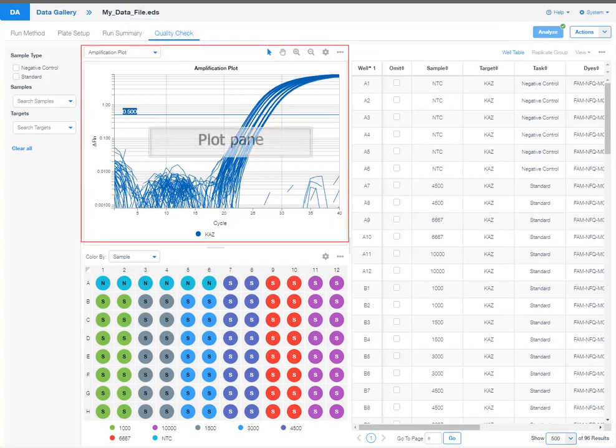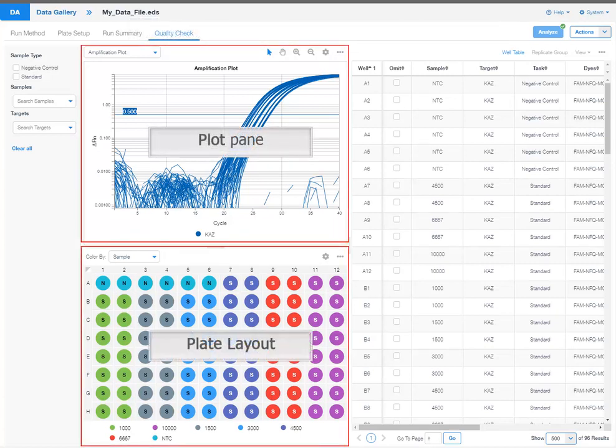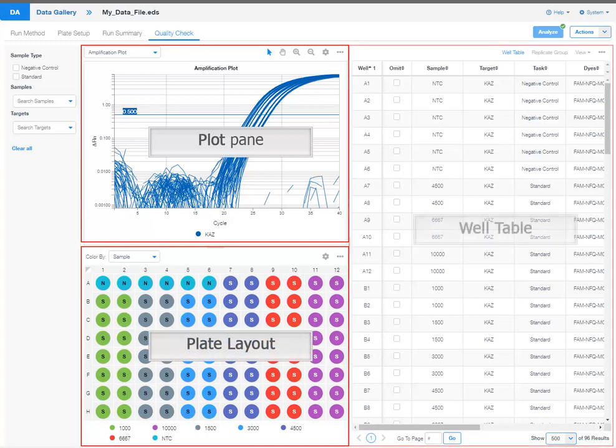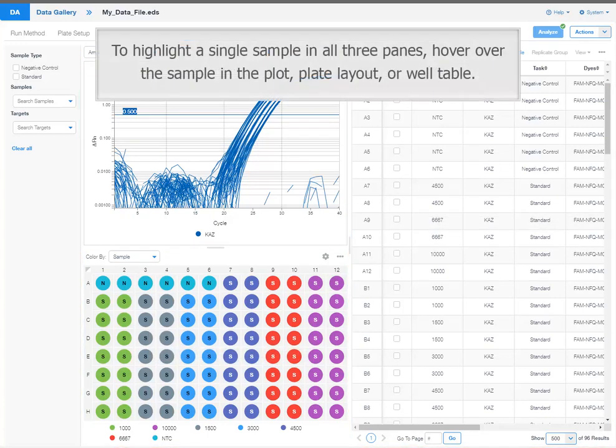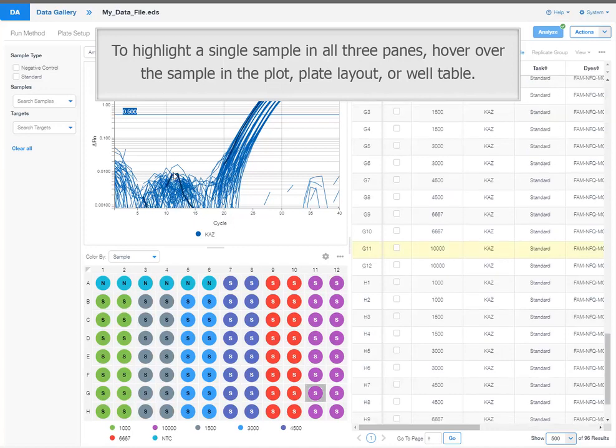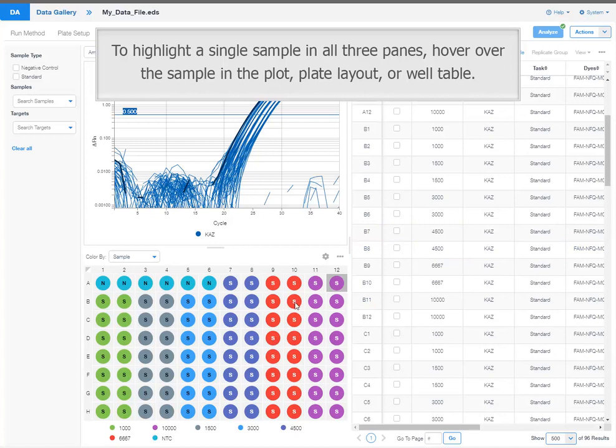You can review the results in the plot pane, the plate layout, and the well table. To highlight a single sample in all three panes, hover over the sample in the plot, plate layout, or well table.